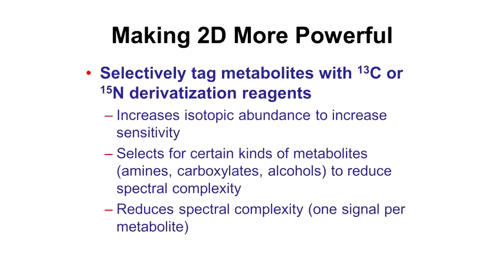If you have a C13 or N15 tag and you tag it close to the unique site of a particular metabolite, you can get a unique chemical shift. So tagging increases the isotopic abundance. You don't have to grow things in carbon, nitrogen media or spend thousands of dollars growing things in carbon dioxide environments for plants or getting mice and rats adapted to eating C13 foods.